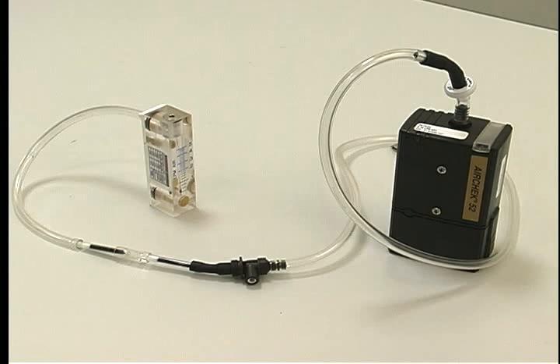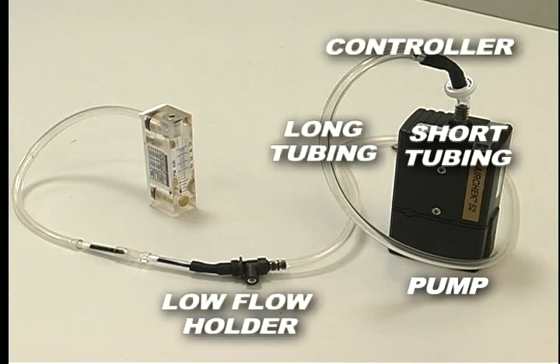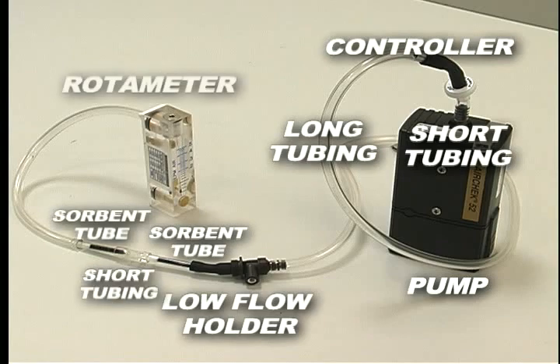The order of the components for calibration is pump, short length of tubing, constant pressure controller, long length of tubing, adjustable low flow holder, sorbent tube, short tubing, sorbent tube, and rotometer.